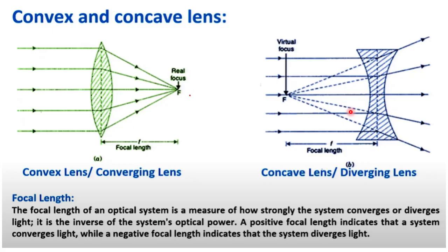In an optical microscope we also need a lens. Basically there are two different types of lens, convex and concave, and we have already read during our class 2 level that, in the convex lens, the parallel light after passing through the lens will merge here, and this distance is called the focal length. And if it is a concave lens, the light will be split away from each other, and that is because it is the arrangement of prisms in different directions.